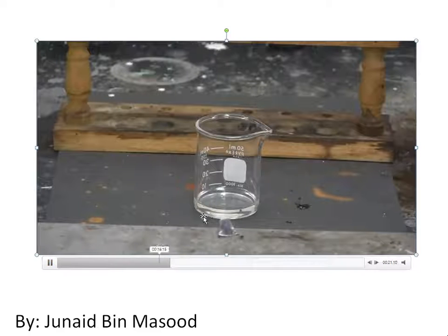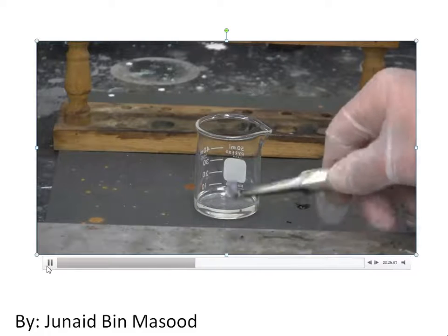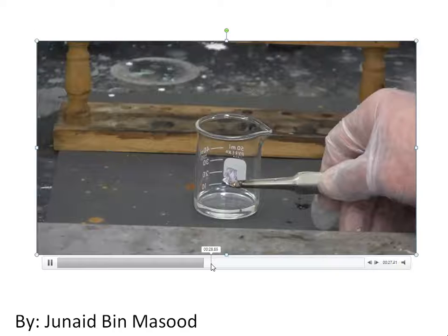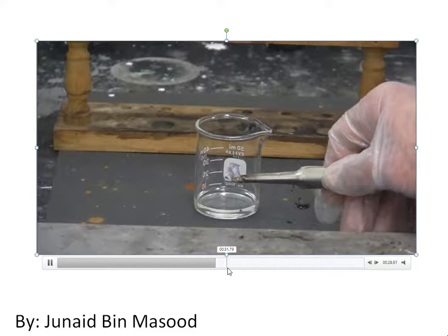Now pouring the acid, and we poured the acid into the beaker, which is nitric acid. Now we are going to put this potassium metal, okay? This piece is potassium metal. We're going to put it inside the beaker in nitric acid.